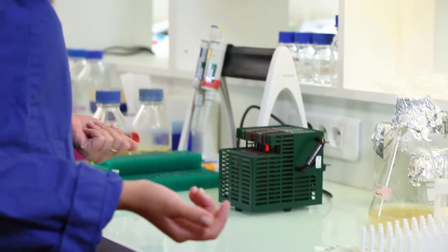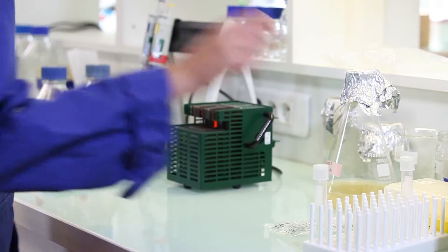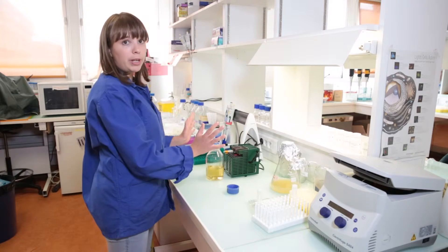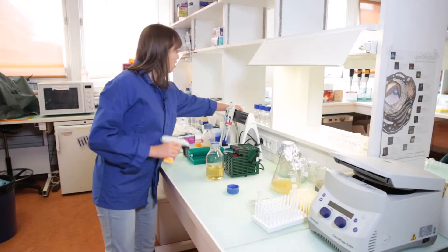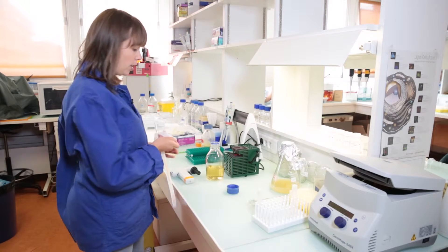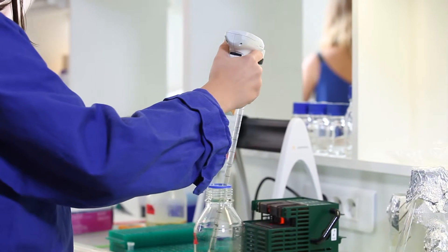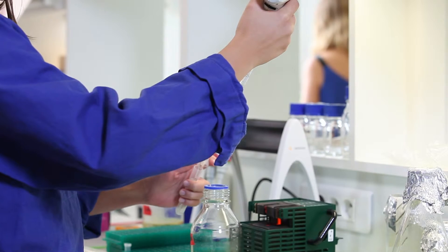So to start, you have to start a bacterial culture. For this, we need a culture tube and some media. To keep it sterile, we will be working around a source of heat. I will now pour some media in the cell culture tube — about 5 ml is enough.